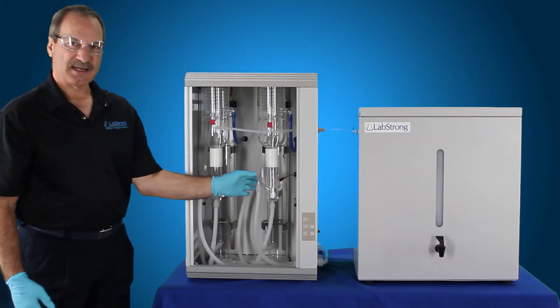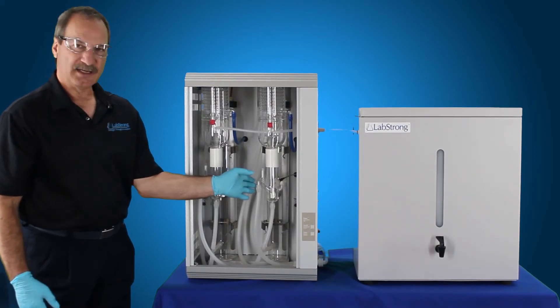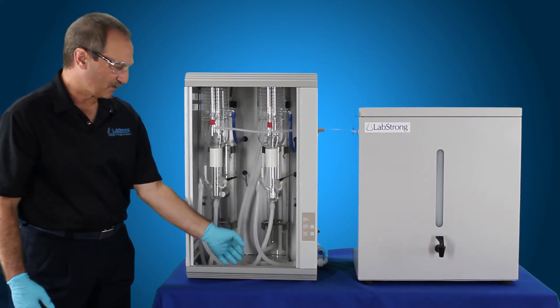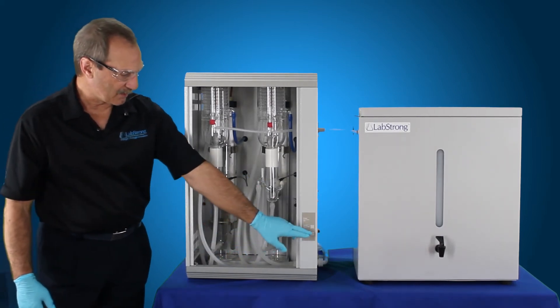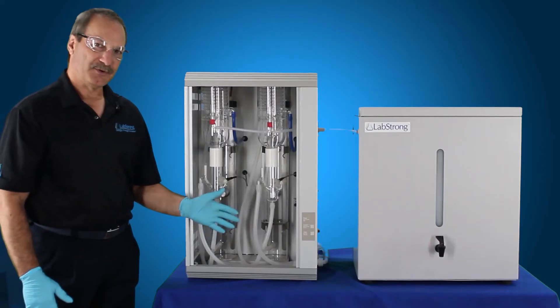Once it touches that, it senses that there's water. It turns the heating elements on for 90 seconds and then it shuts the heating elements off. It also shuts the water off so you don't have any of that solution coming out down the drain. Now the only thing that's going to be on at that point is just your clean button.